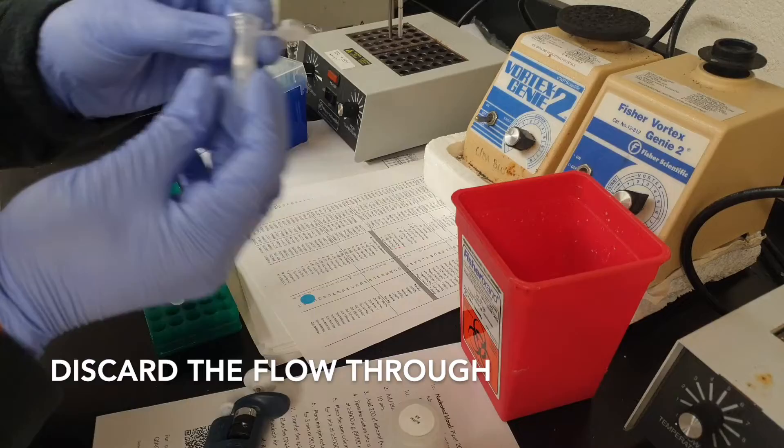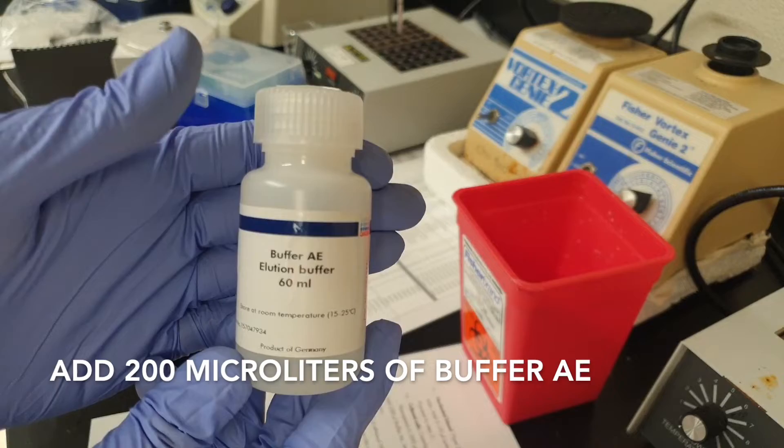Now discard the flow-through; that solution should have AW2 in it. Then transfer the spin column into 1.5 ml tubes, not 2 ml this time.